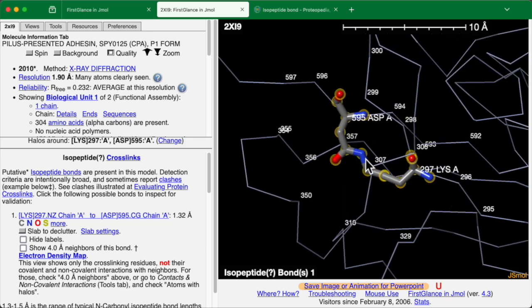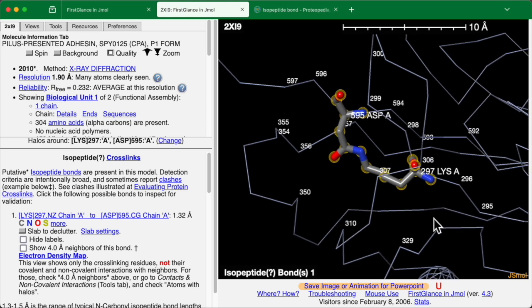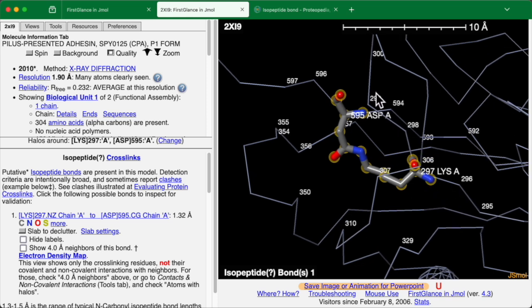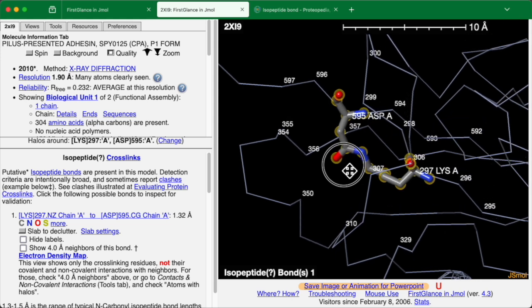Now aspartic acid, of course, normally has two oxygens on its side chain. But we see here that one of them is a nitrogen. And that nitrogen comes from a different section of the backbone trace, from lysine 297, whose side chain ends in a nitrogen, which has formed a peptide bond between the two side chains of these amino acids. That is an isopeptide bond.